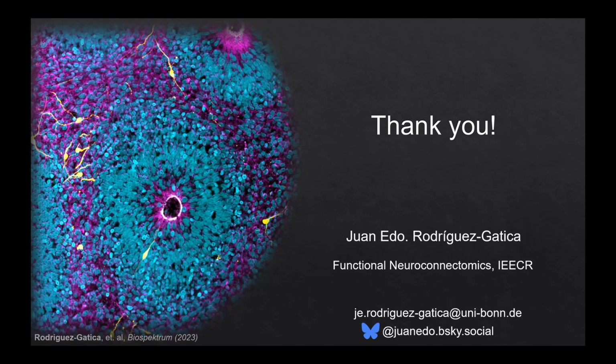Only the ones where we did the analysis of the pre and postsynaptic distances. The rest of the images are just how they look after coming out of the light sheet. To give everyone an idea, we are going to have a little practical course of Imaris, so you have an idea of what you can do with the software. It was a really impressive work. Thanks.